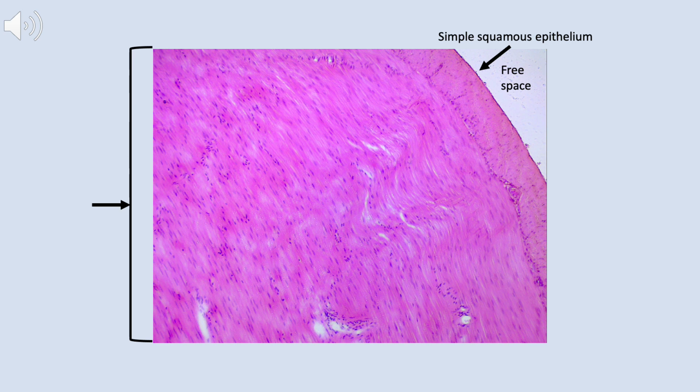And we can look at that and we see it has a lot of nuclei, those purple dots. And so that's going to tell me that this is most likely muscle or epithelial, which we ruled out epithelial. So we're probably looking at muscle. So is it smooth, skeletal, or cardiac? Well, there's no striations, which is a dead giveaway that we're looking at smooth.